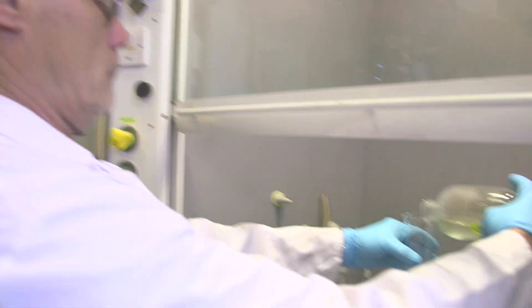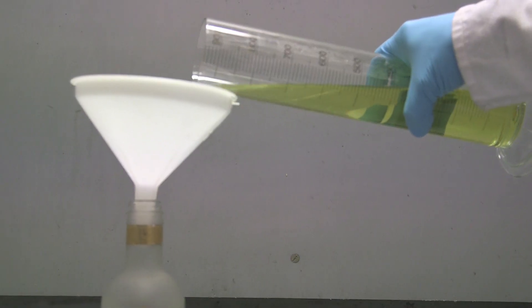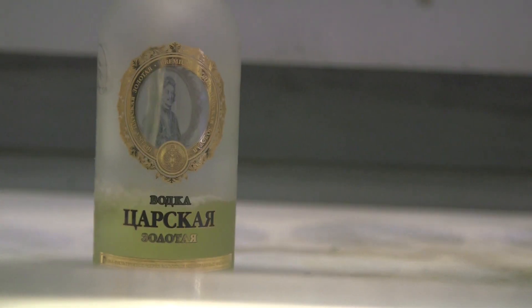So I gave him the bottle, and possibly he tested the little bit of vodka that was left. And then he's now done the experiment. Of course, we have already shown you gold dissolving in aqua regia — I wanted to see it in the vodka bottle.